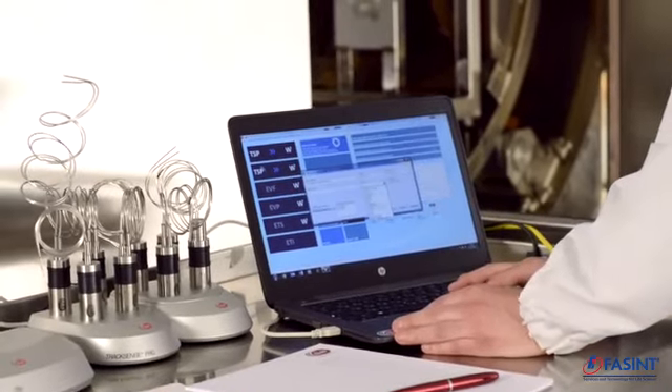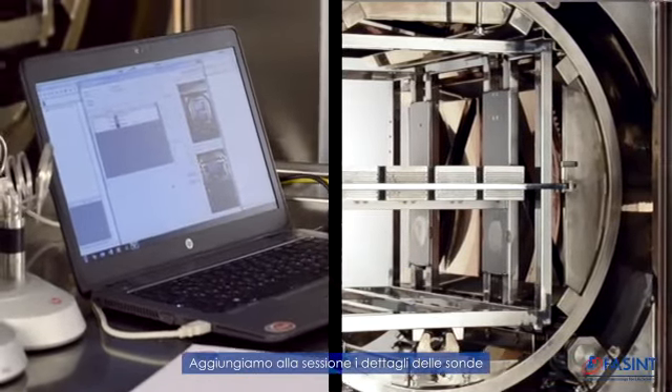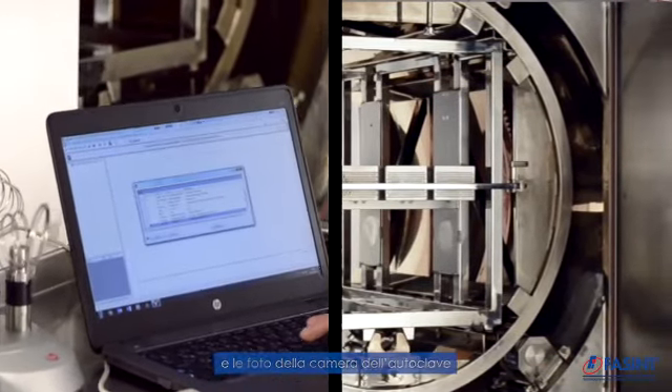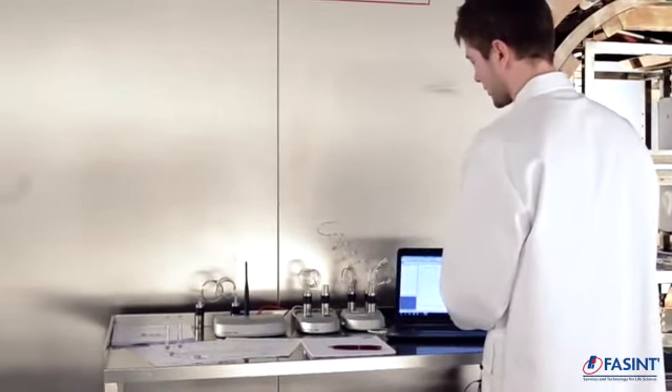We click Add Unit. Here you can see the list of your units. Before adding it, you can also preview your setup with pictures of your loading map. This is our chamber. We load it and click OK. The unit is now added to the session.